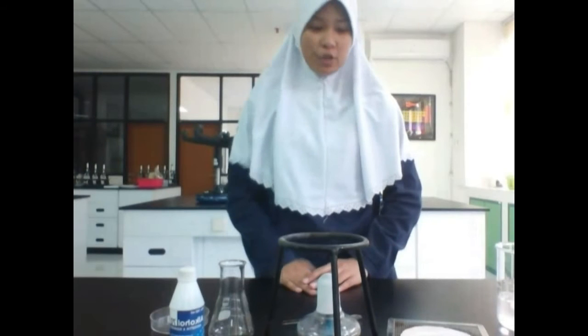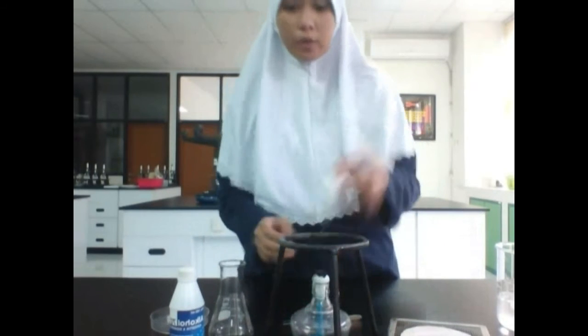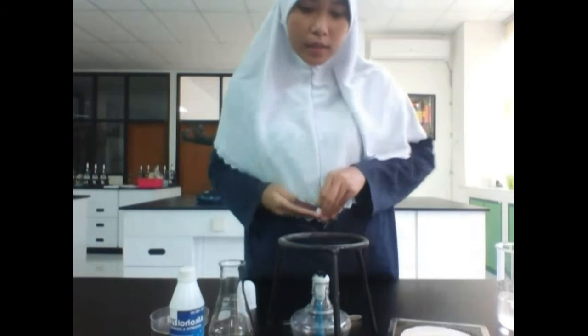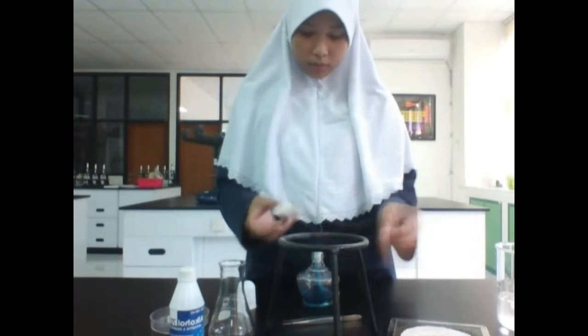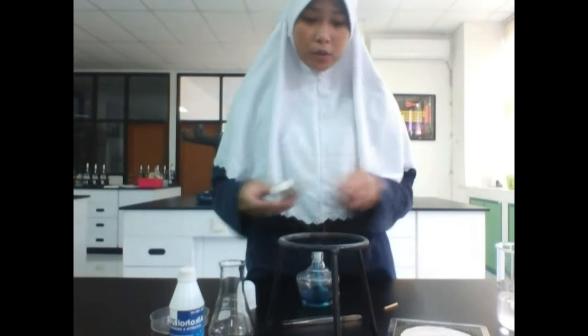The first thing you need to do is to boil water using this Bunsen burner. You don't have to use so much water.